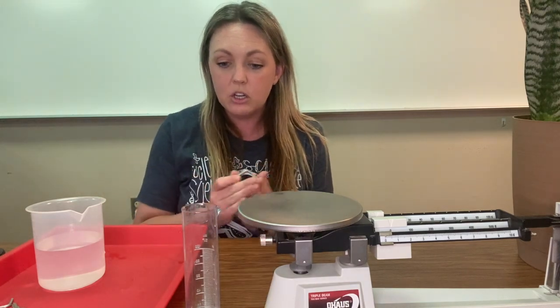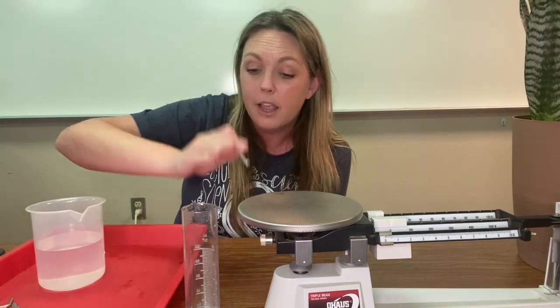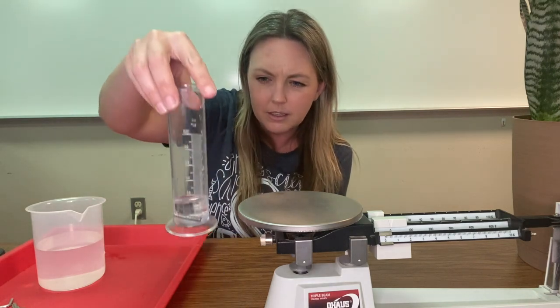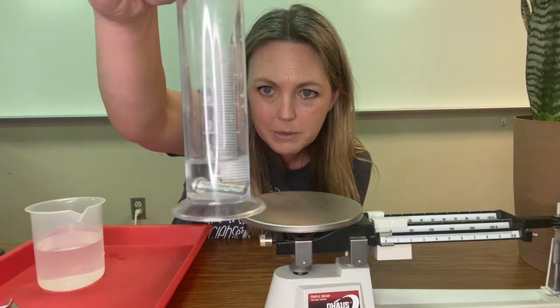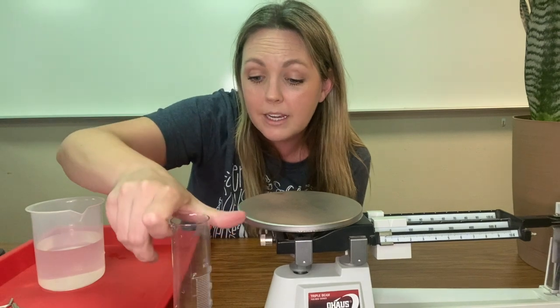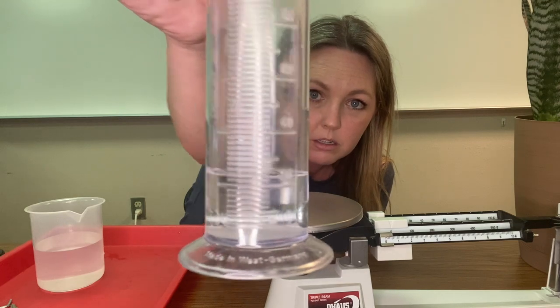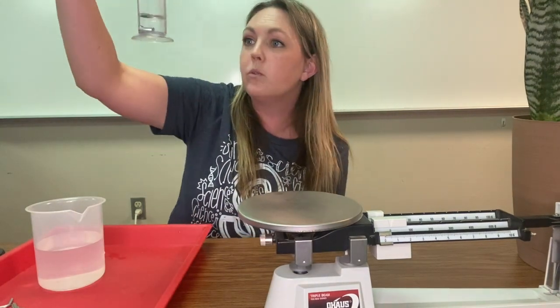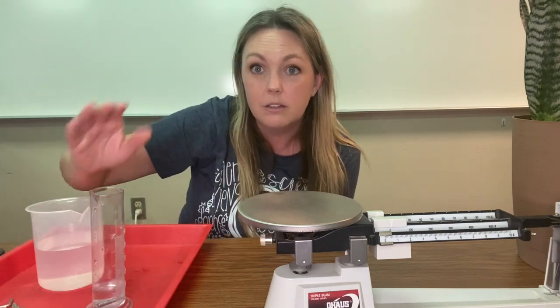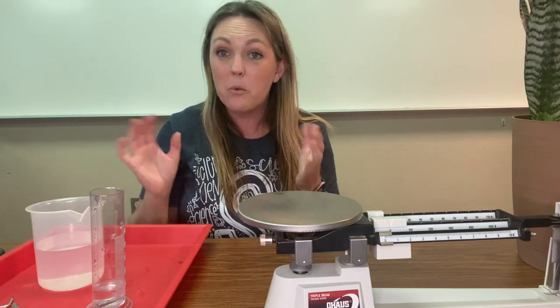To measure the volume displacement, we place the item inside the water and we're going to measure the difference. Wow, that only went up one milliliter — one milliliter. The change was from 23 milliliters to 24 milliliters, so 24 minus 23 is one milliliter.